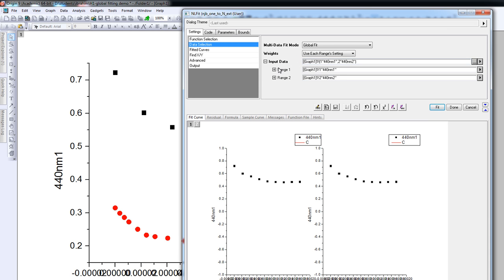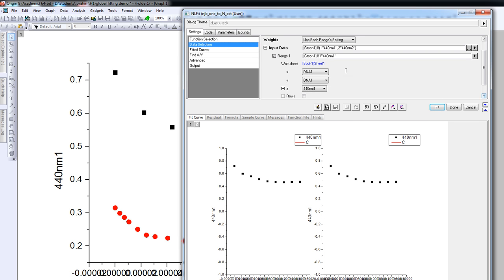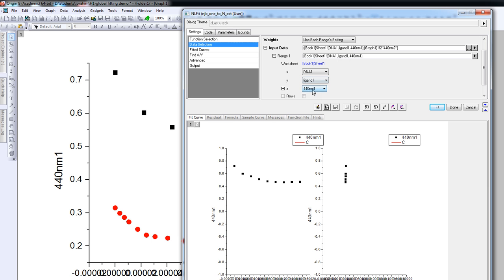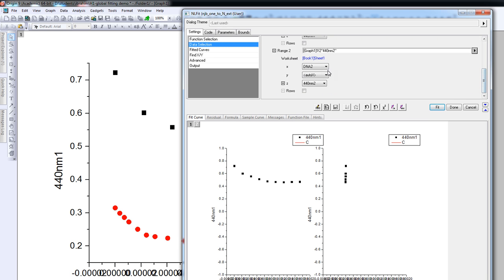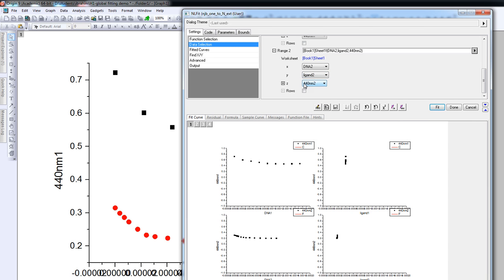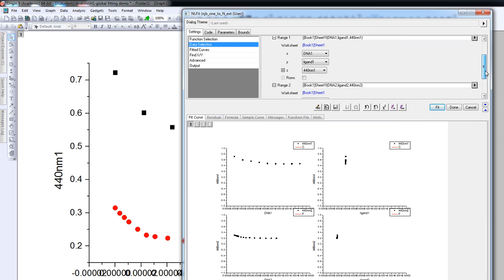The next thing I need to do is identify, or tell Origin, the range of the data. This is where the X, Y, and Z definitions really start to matter. X is DNA 1, Y needs to be ligand 1, and Z is the absorbance at 440 nm for titration 1. So we tell the software the range of DNA concentrations, the range of ligand concentrations, and the associated absorbances. We also expand range 2 to define DNA 2, ligand 2, and the absorbance for titration 2.